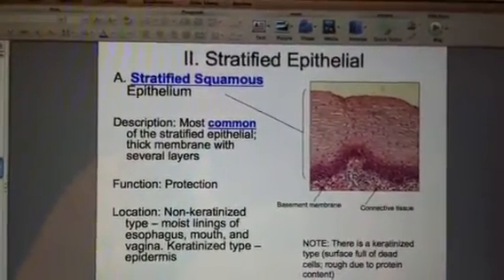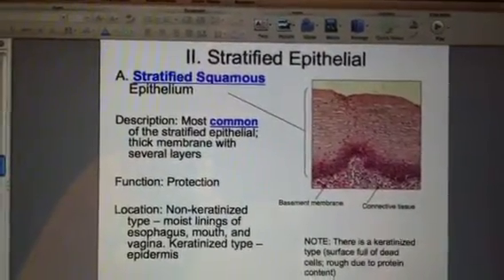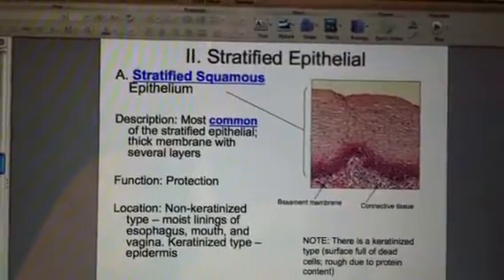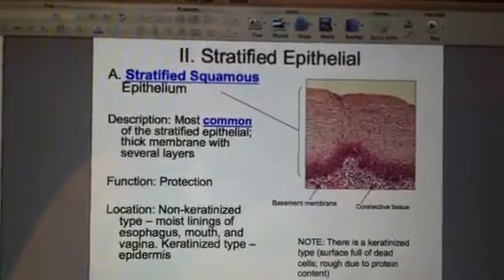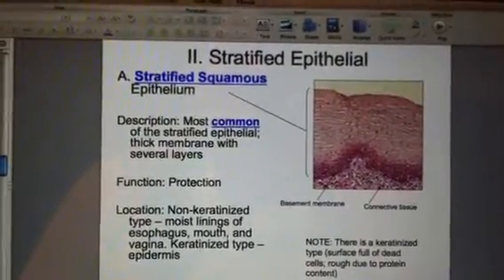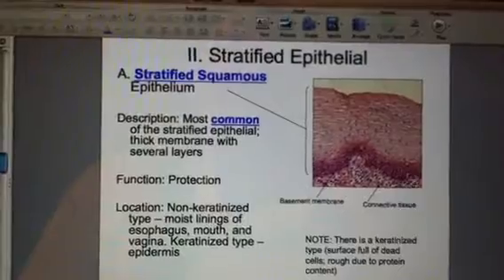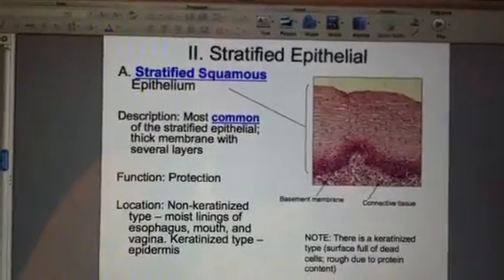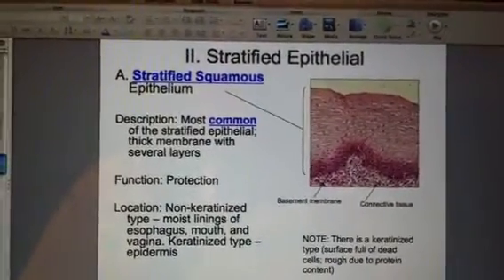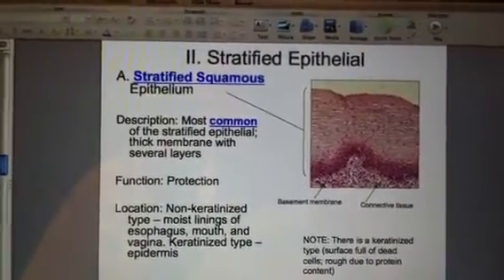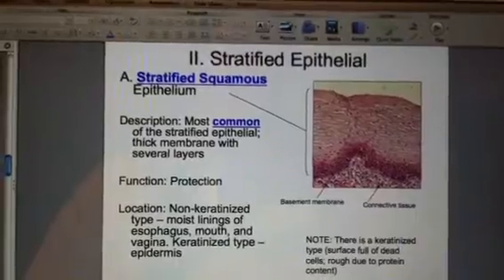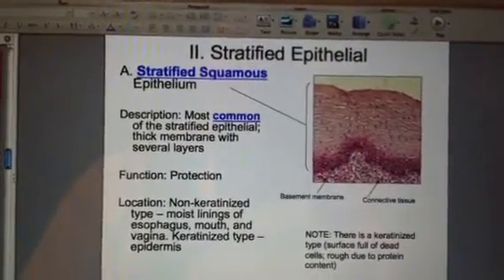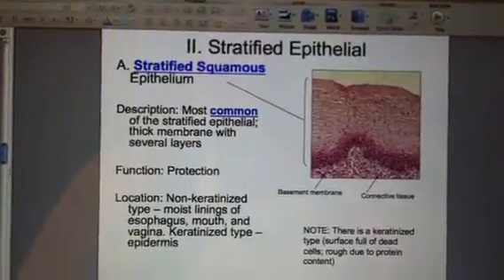We've been talking about epithelial tissue and now we're on slide 14. We're leaving simple epithelial and we're journeying into stratified epithelial. Can you remember what stratified means? Maybe you can remember the strawberry shortcake that you saw earlier — it means layered.